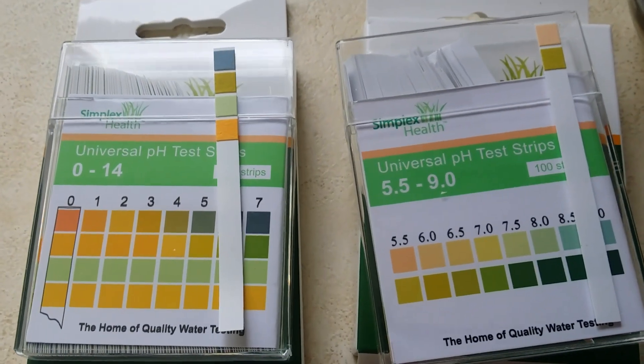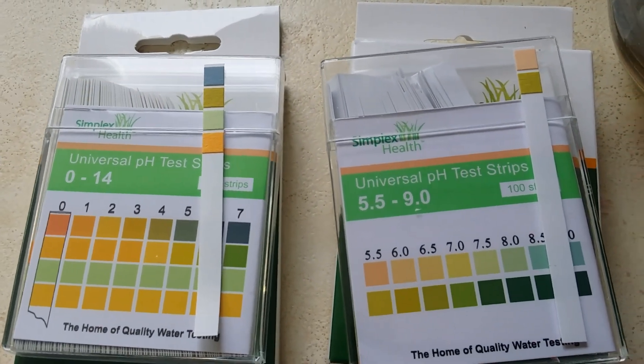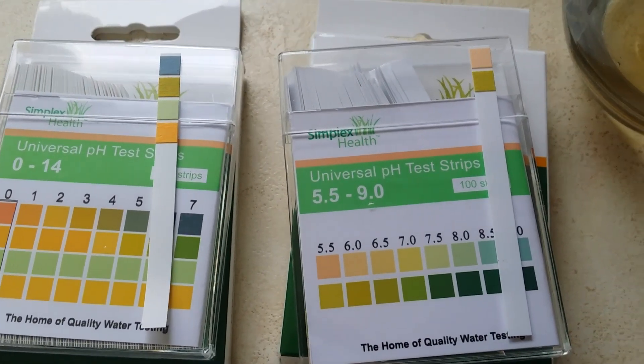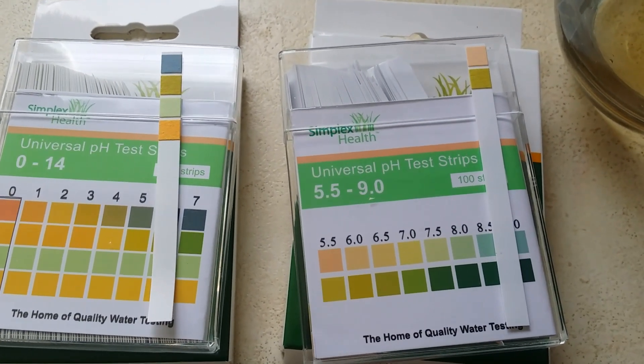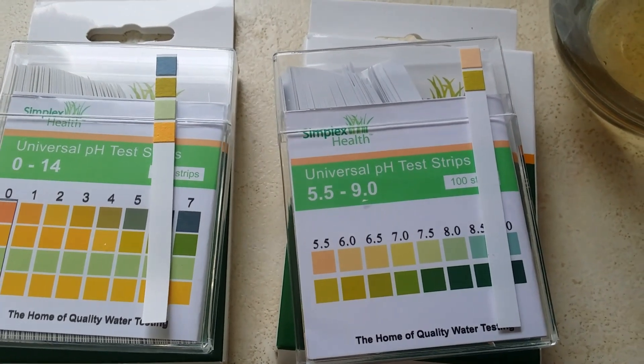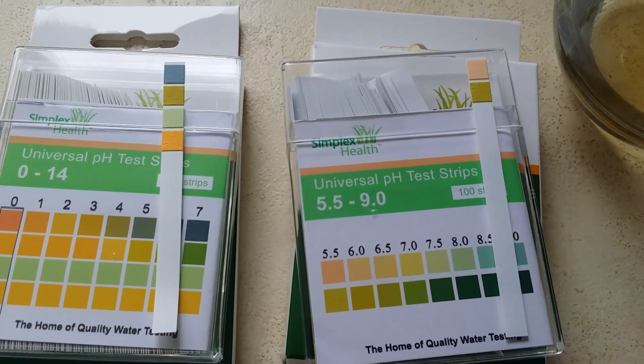I'm going to demonstrate it first of all with the universal 0-14, then with the 5.5 to 9. Now the 5.5 to 9 actually has a higher range than what the vinegar is, but it should show you how to still use the test strips.